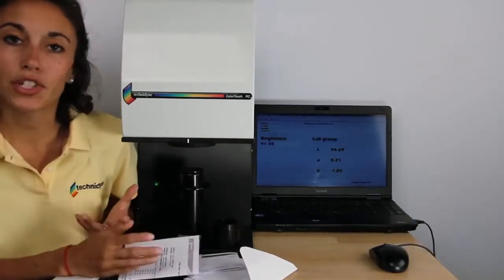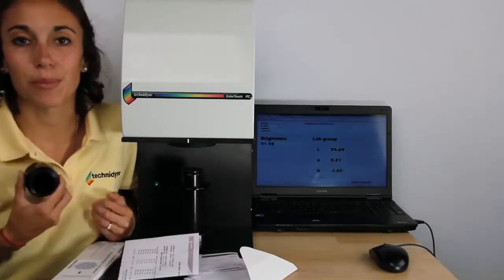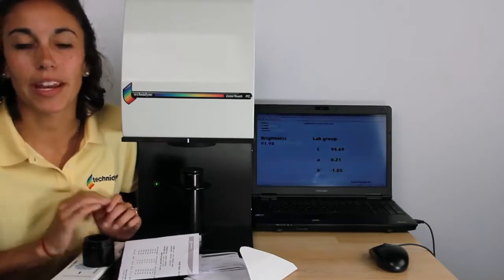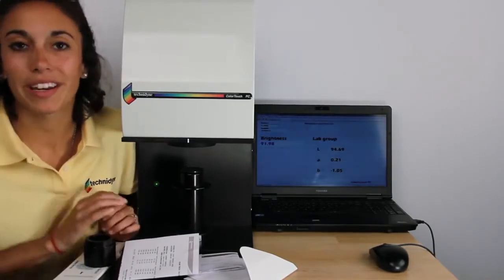The last thing that you should have, which came with your instrument, is your black cup. Once you have all of this together, you've got your computer hooked up to your instrument and your software up and running, you're ready to get started.